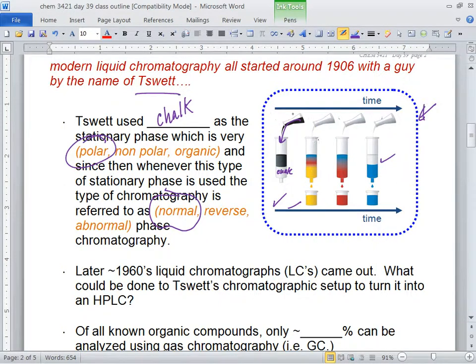How do you draw a balloon? And you'd have to keep refilling the balloon, but no big deal. You pop it off, blow it up again, right? Because you're just forcing the stuff through. Then all of a sudden, it's high pressure chromatography. They like high performance, but pressure makes a lot more sense because that's what it is.